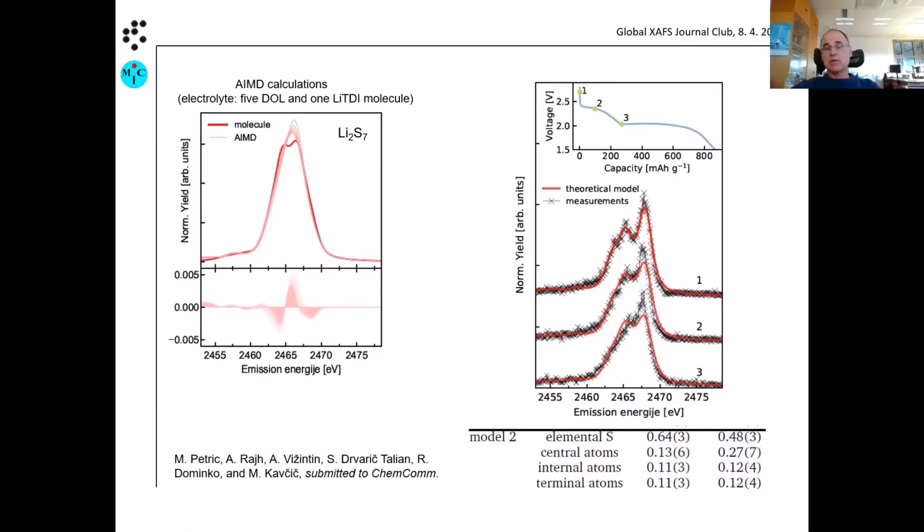And I see absolutely no reason why one would not be able to measure this in operando, and we will do that for sure. We just need to find good conditions, because there is a problem with the probe. Protons are not really favorable, but the methodology here, I think, proves that batteries could be characterized also within a lab. We were not sure about that, but now we are pretty convinced, and I think we will do this in the future in different systems.